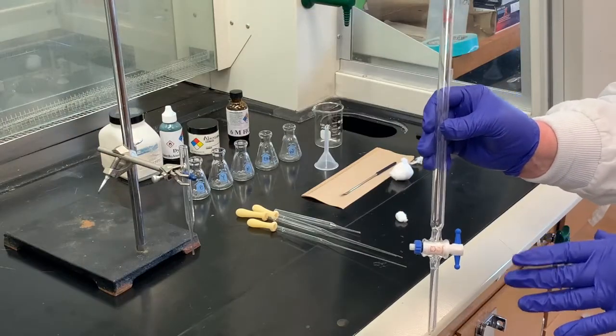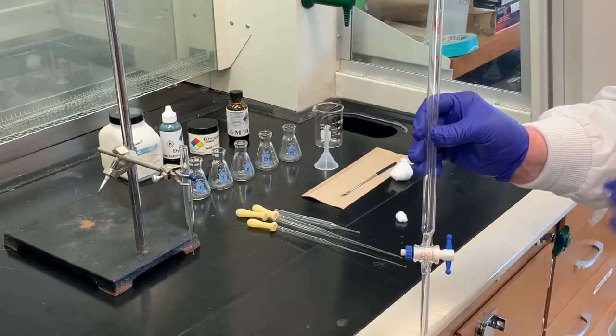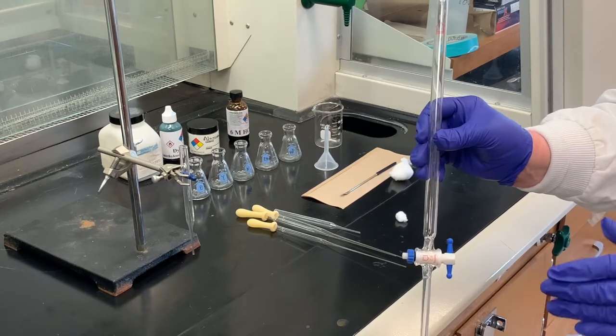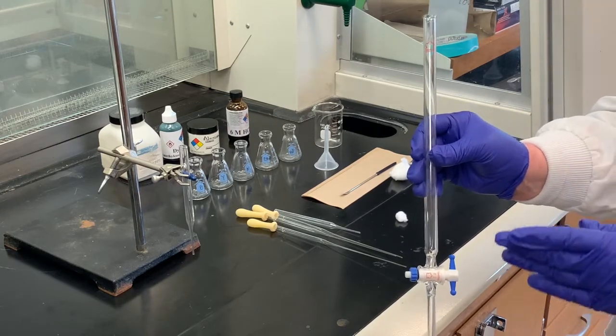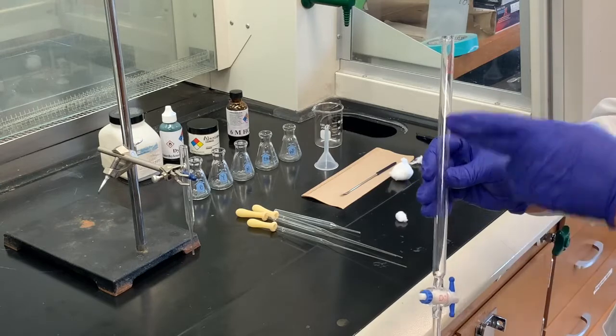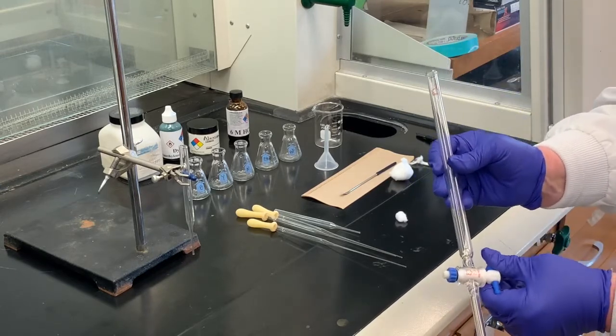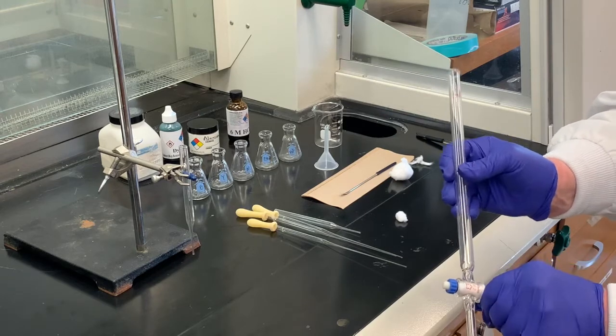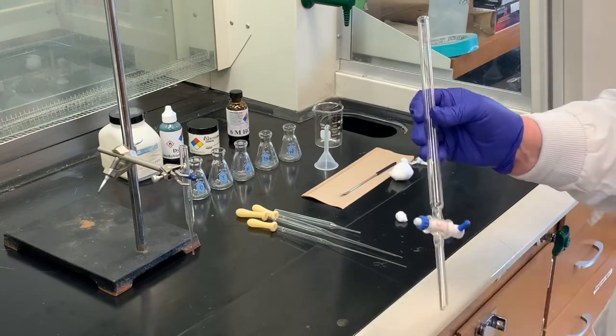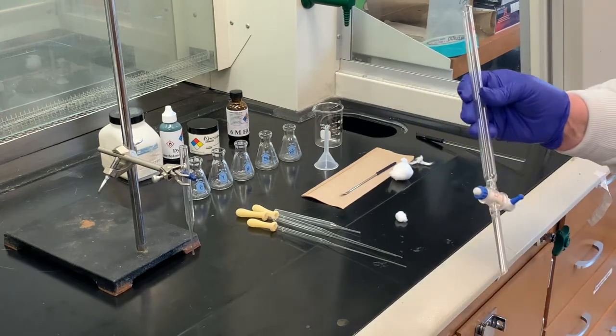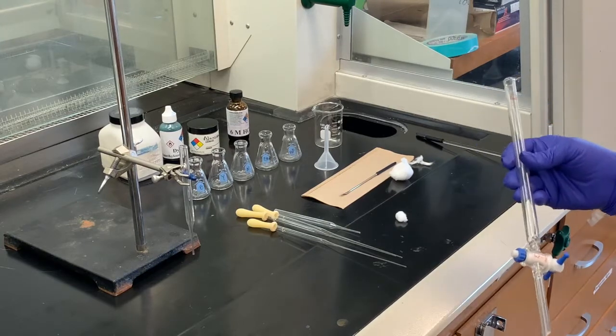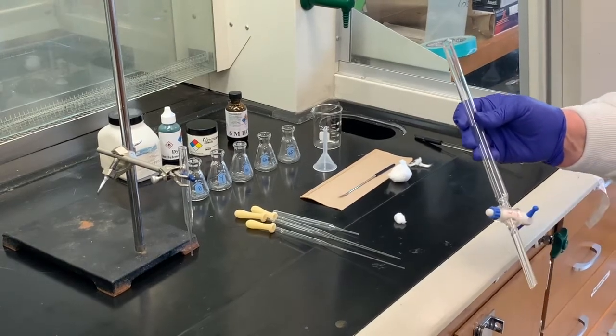Before we get started, I wanted to give you an idea of what a traditional chromatography column looks like. It looks very similar to a burette, although you'll notice there's no graduation marks here. There is a stopcock. And typically, when you separate things by column chromatography, just to compare thin layer chromatography, which is what we did in the previous experiment compared to column chromatography.